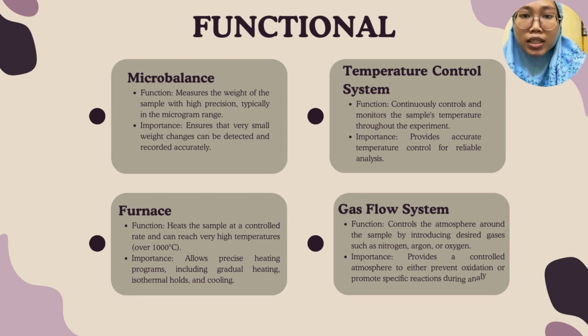degrees Celsius. The importance is to allow precise heating programs including gradual heating, isothermal hold and cooling. Next, temperature control system. The function is to continuously control and monitor the sample temperature throughout the experiment. The importance is to provide accurate temperature control for reliable analysis.